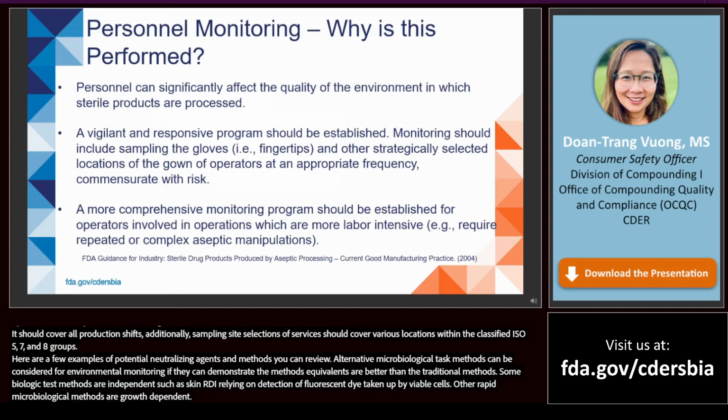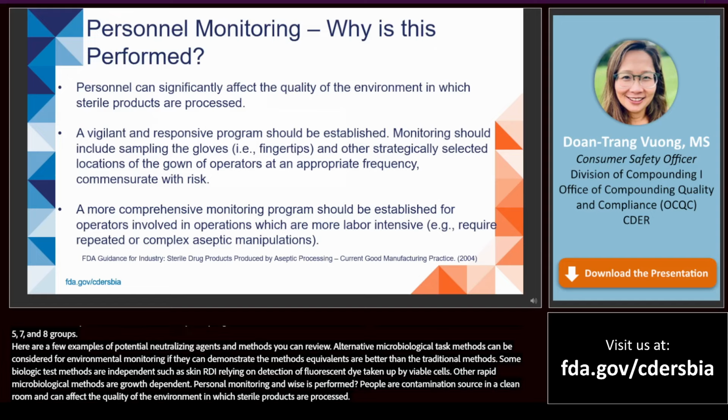Personnel monitoring, and why is this performed? People are the primary source of contamination in a cleanroom and can significantly affect the quality of the environment in which sterile products are processed. A vigilant and responsive program should be established as control.